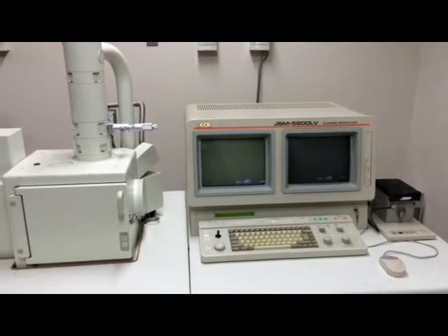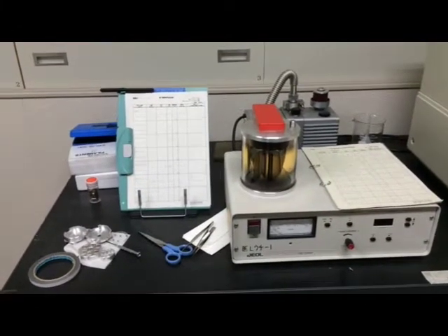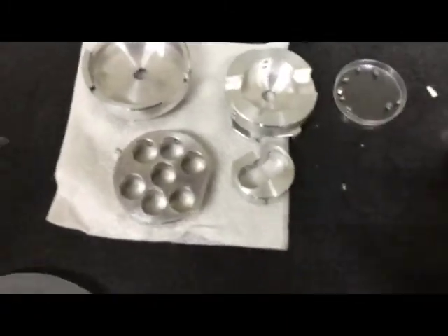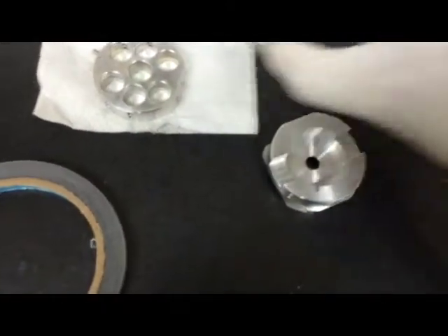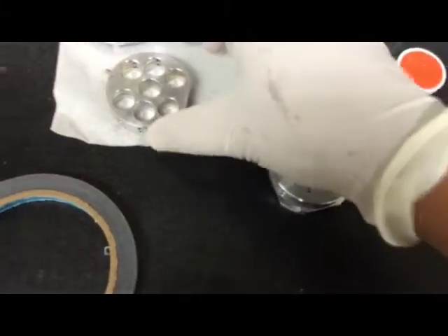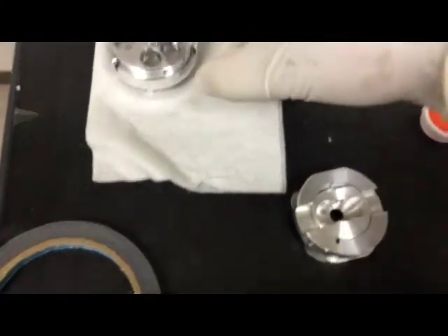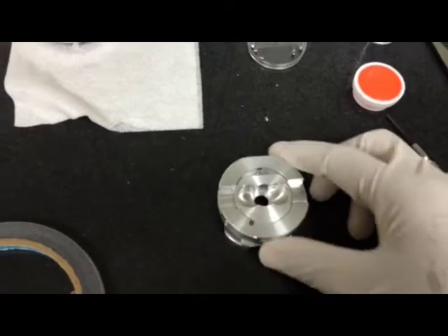Wait for warming up for about 10 to 15 minutes. While warming up, you can prepare the sample. We will start with sample preparation using this.